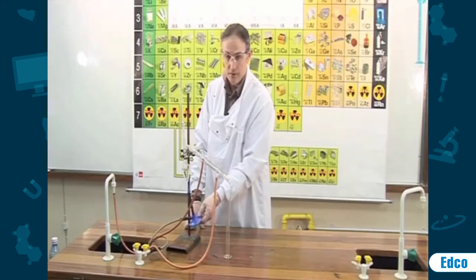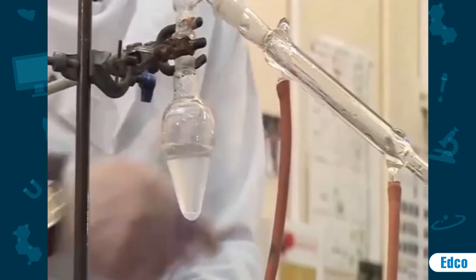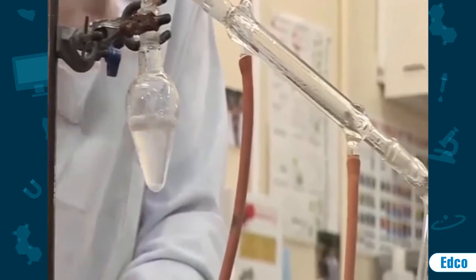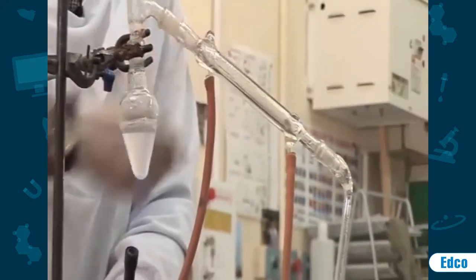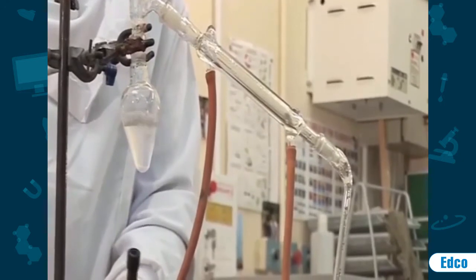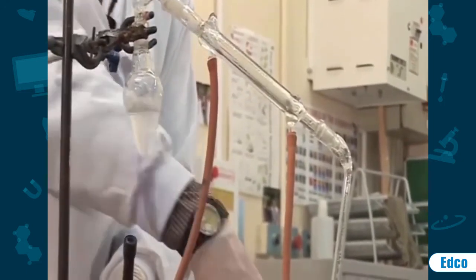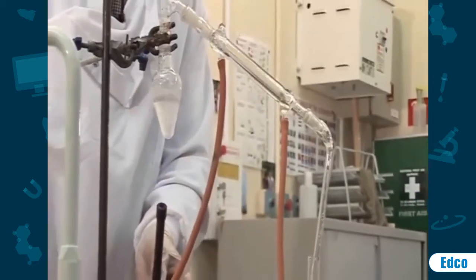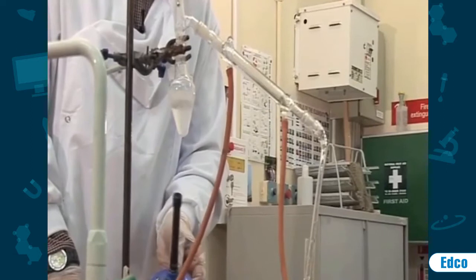We merely want it to reach 78 degrees. A liquid can be seen forming in the condenser — that liquid is the alcohol vapour which has travelled down into the cool condenser where it has condensed back into alcohol liquid. The liquid is forming in the graduated cylinder and our separation is going nicely.